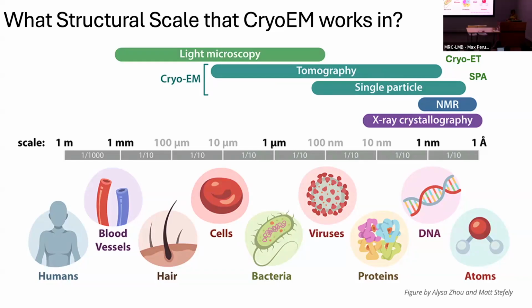But with modern techniques like cryo-EM, we now freeze the sample. This reduces radiation damage and improves resolution. So we think there is still much space to improve.